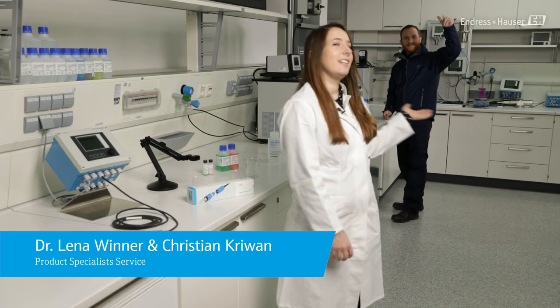Hello, my name is Lena and this is my colleague Chris. Today I will show you the commissioning of a standard pH glass sensor with integrated reference element, gel electrolyte, and built-in temperature sensor.